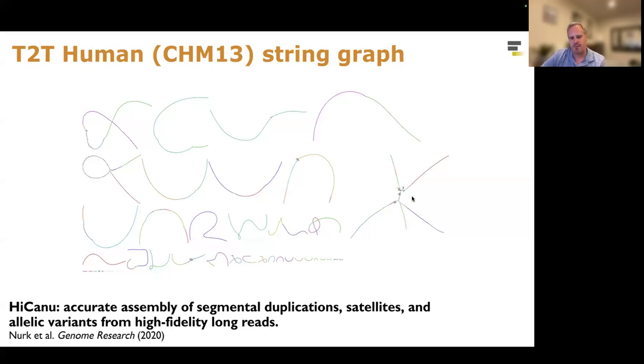Although there has been a lot of work, thanks to, for example, Verkko assemblers that can integrate HiFi data with ultra-long nanopore reads, you can often get complete telomere-to-telomere chromosomes using the Verkko assembler.